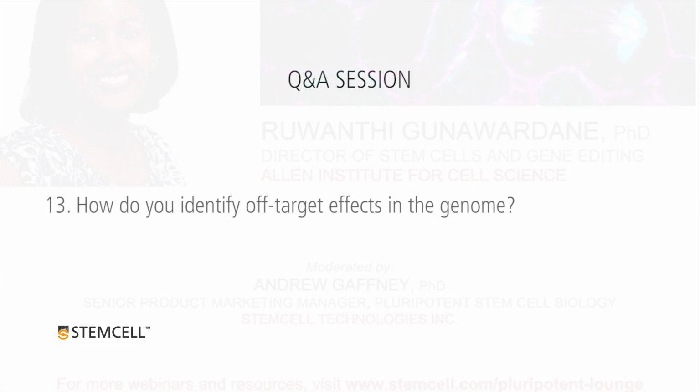And this work is just still ongoing because it took us some time to do the RNA-seq and exome-seq, and we're getting that data right now. We hope to share that as well through our website when we do have it. But just from the Sanger sequencing and just looking at our first 10 lines through exome sequencing, we are still not seeing anything.